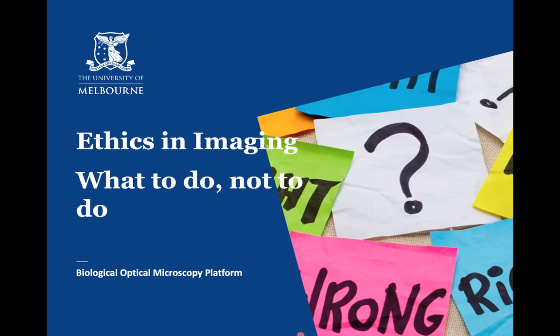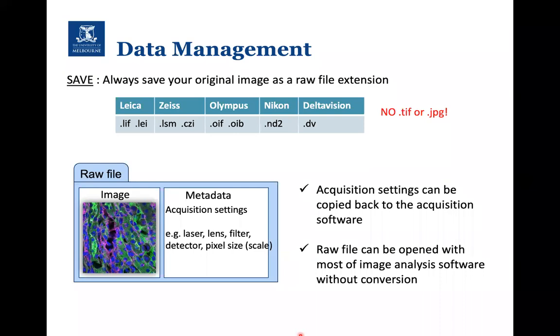So now we've generated our images. We'd like to go through some rules in terms of what you can do to them and what you shouldn't be doing to the images. Okay, so we'll start off with data management.